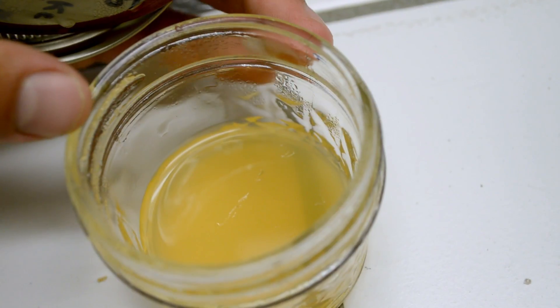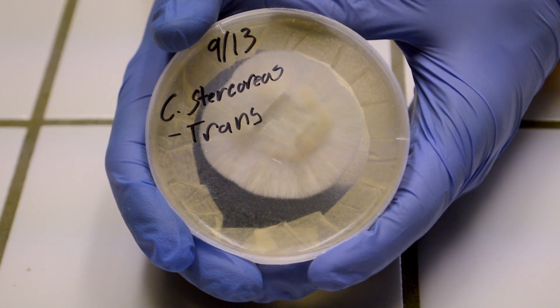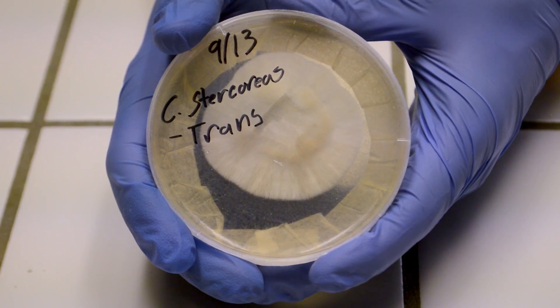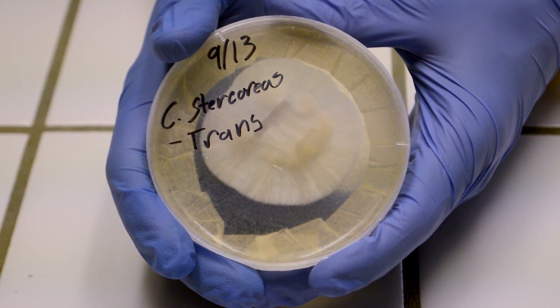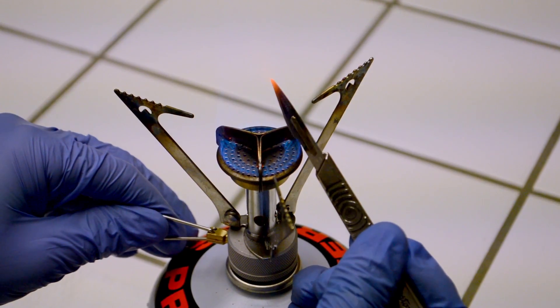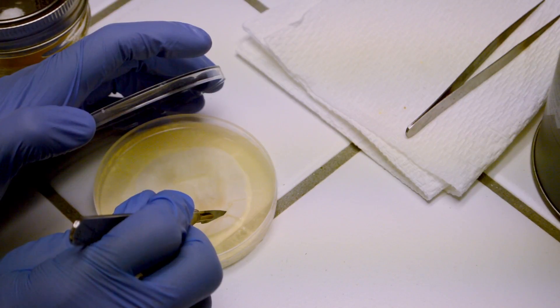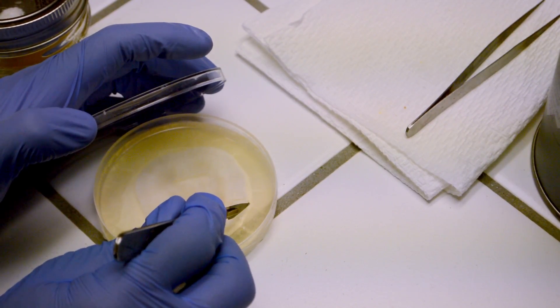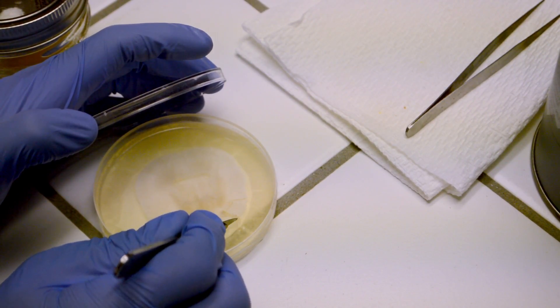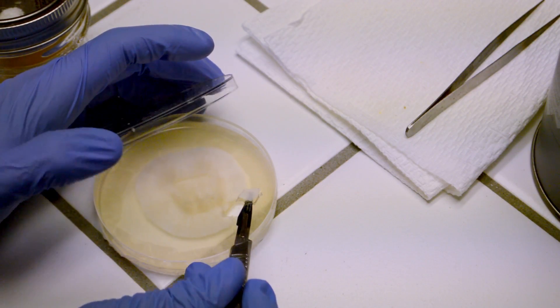Now seal up your lids and place them in a suitable place for incubation. The third method we will outline is the agar to agar wedge transfer method. In this method, you will need an agar plate that has already been cleanly colonized by the desired mushroom strain. Then with a flame sterilized razor, cut a wedge of mycelium from the plate, preferably at the leading edge of the culture as this is the most vigorous and active site of mycelial growth. After you have removed your wedge, go ahead and place it at the center of your new petri plate.